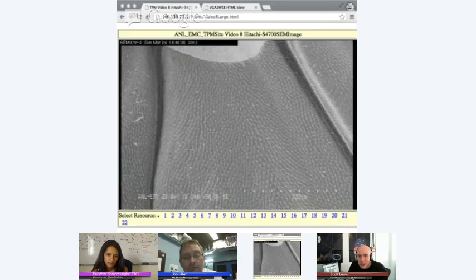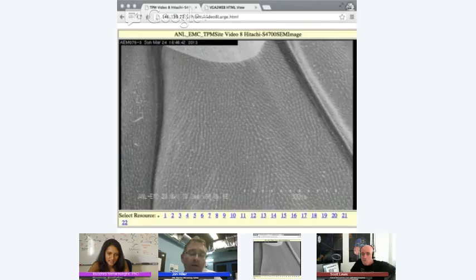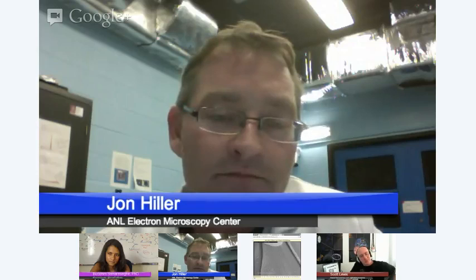No, this is awesome. But I wanted to touch on something pretty cool. So we have an electron microscope and it scans and we get these great images and we can see things that are really cool. But one of the things that I do here also is modify and design different things that don't exist everywhere. These things have been commercially available for a while. However, we've modified some of the commercial things. If you build a TARDIS, I will be completely jealous.